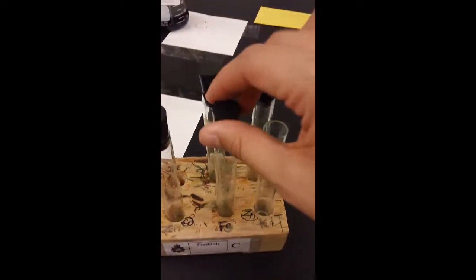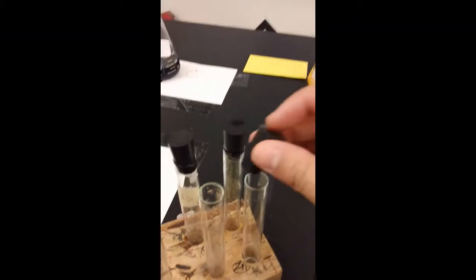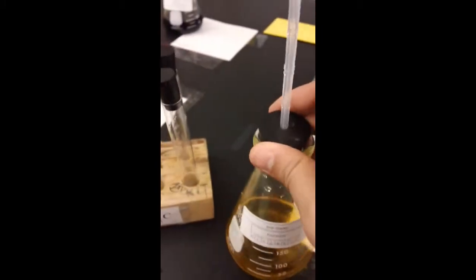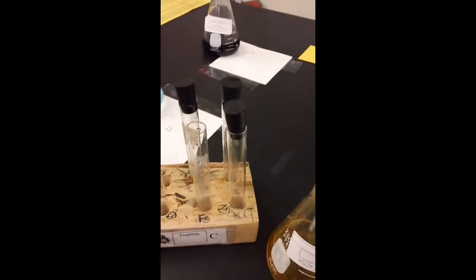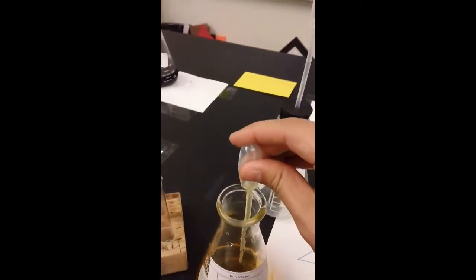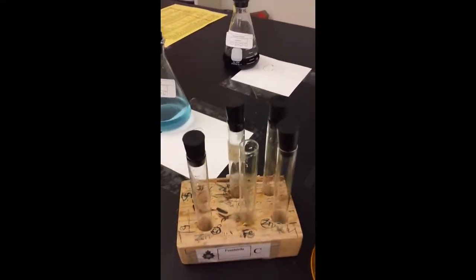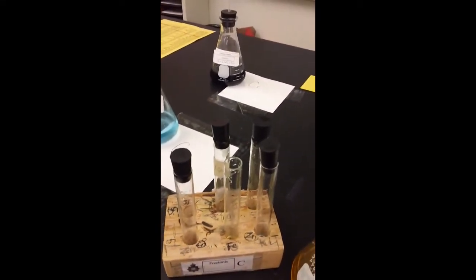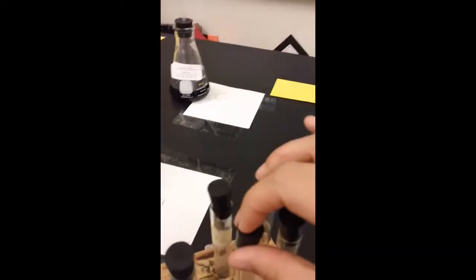Next, we're going to put in our Fe into this test tube. We want to make sure we're not mixing pipettes, so this is my Fe. I'm going to bring it over here, put it into my labeled Fe test tube. Remember, we're doing 1 milliliter. Put my test tube back on.